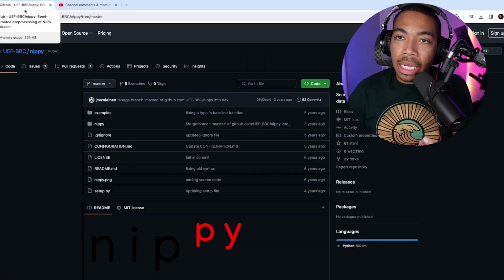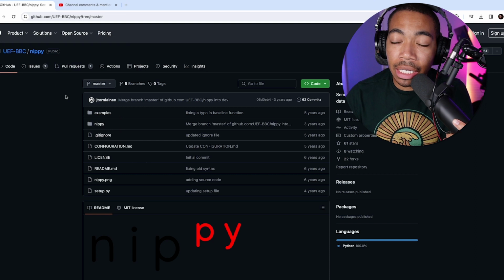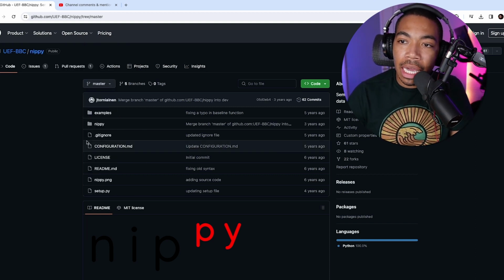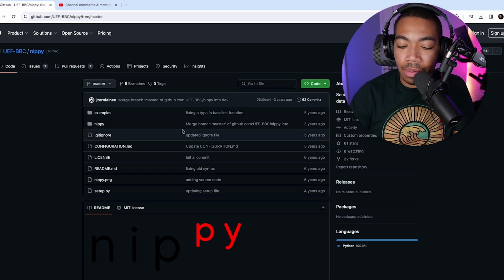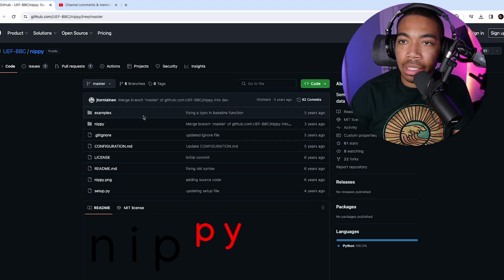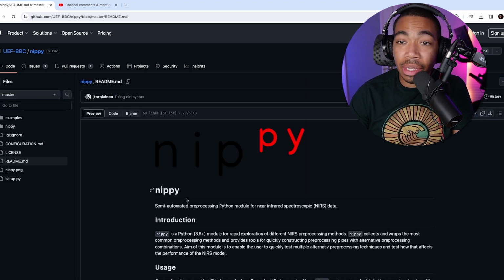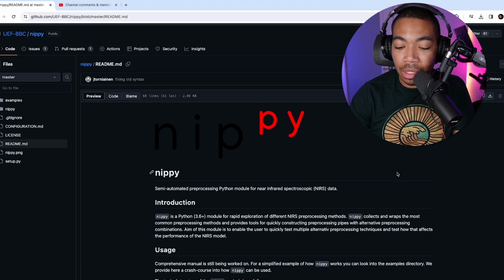So here it is. This is the Nippy library. This is the Nippy GitHub page. I just searched Nippy NIRS and then came to this page. In this, as you can see, we have a typical GitHub page where we have some examples, some documentation, a README file. Let's see if there's anything there. I haven't really looked at this too much, so we're all going to be looking through this together.